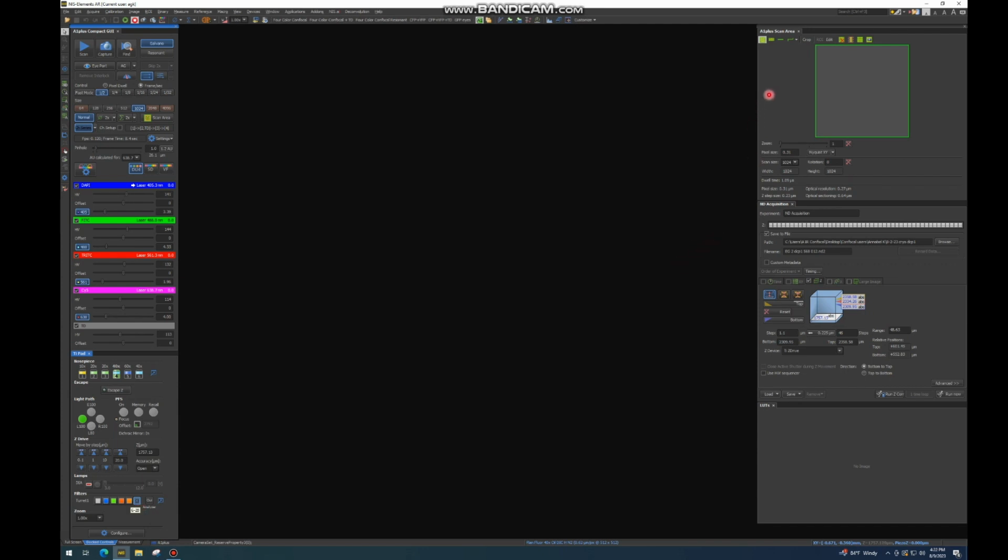So here we get onto the A1 scan area. And what this does is it allows you to zoom into a specific part of your sample image without changing the objective. And you can do this by shrinking this box, right-clicking to confirm a new scan area. This feature is really nice if you want to take both a zoomed out image and a zoomed in image without changing the objective and losing your plane of focus. It's also just faster than changing the objective.